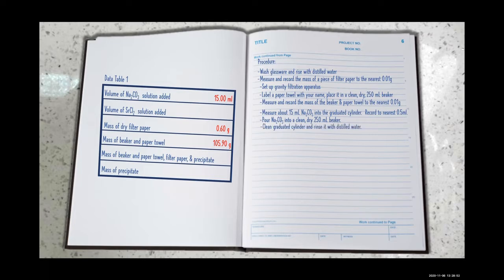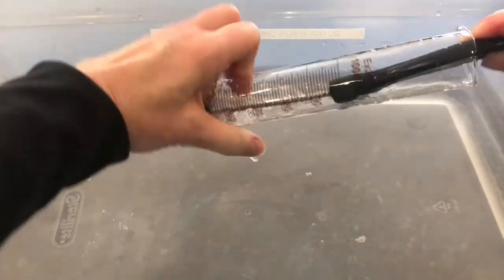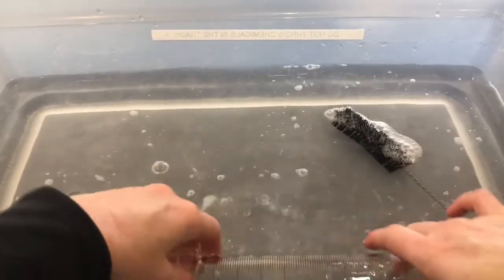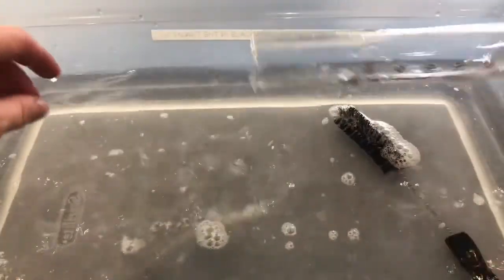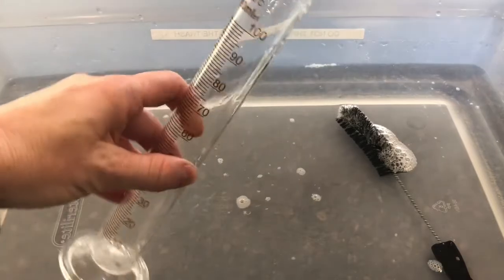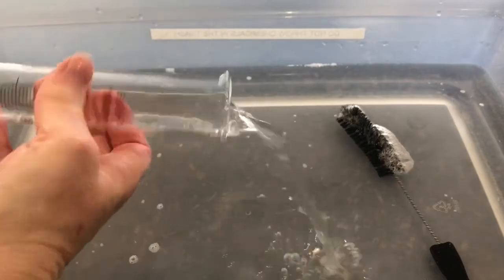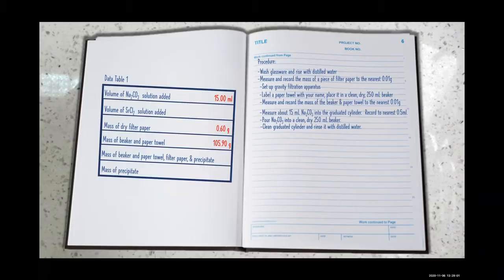Let's clean our graduated cylinder and rinse it with distilled water. Next, we'll measure about 25 milliliters of strontium chloride into the graduated cylinder and record that to the nearest 0.5 milliliter.